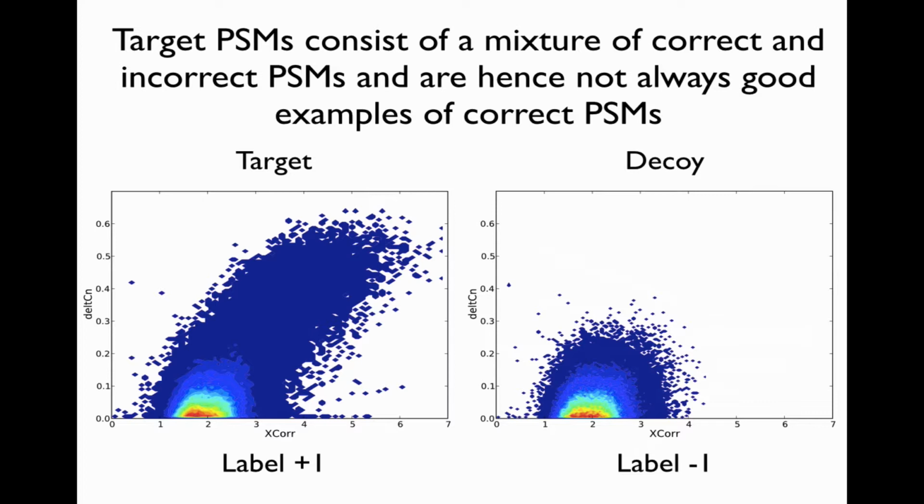I used a color code so that white means an area where no peptides were observed, blue some peptides, and red means quite a number of peptides in this particular area. What I want you to note with this image is that the same distribution we got for our decoy PSMs, this little bun, actually reoccurs inside the distribution of target PSMs. We see the same little bun here, but accompanied with a shark fin sticking out from it, consisting of potentially the correct identifications, that is, the identifications we're looking for.